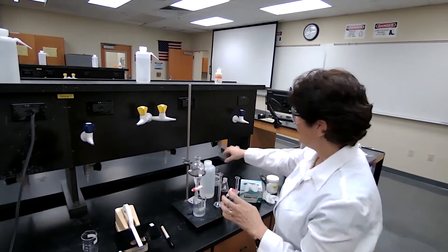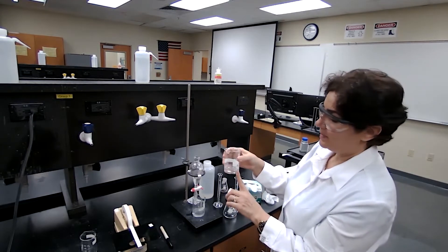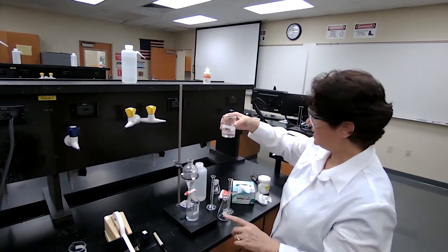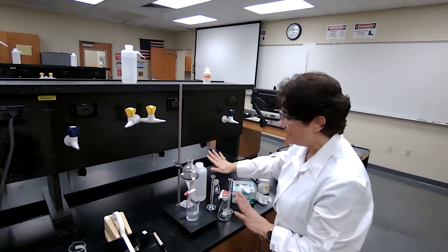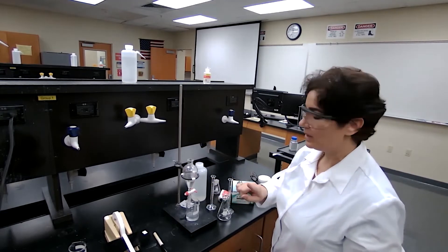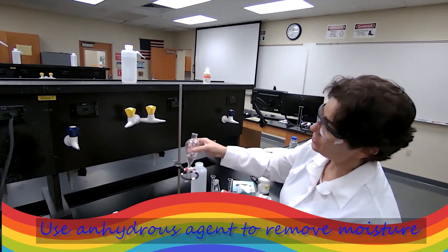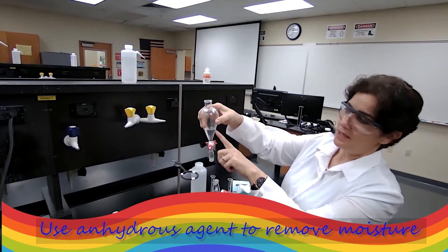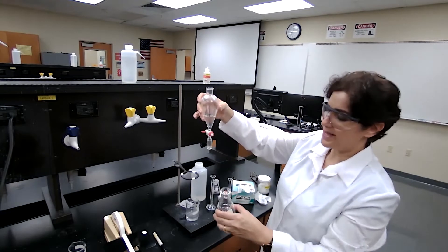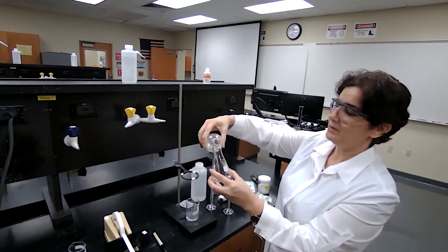What we have now: in the beaker we have the aqueous layer containing the organic acid, which is the sodium salt of benzoic acid. And we have the ether layer, which contains the organic neutral compound. Even though we washed with saturated sodium chloride, there might still be some moisture — I'm going to transfer the ether layer into an Erlenmeyer flask.